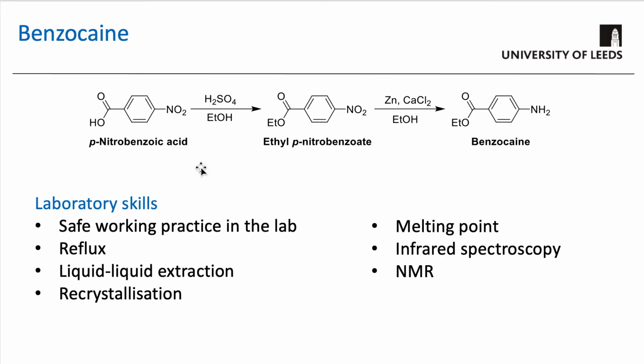The purpose of this experiment is to give you practice of doing a multi-step reaction. Most molecules are made in more than one step, so it's something you have to get used to.